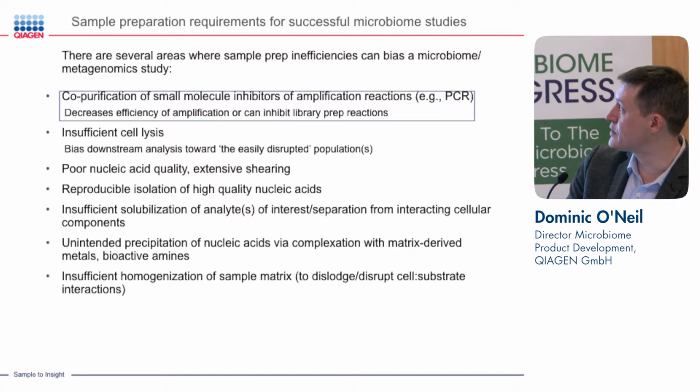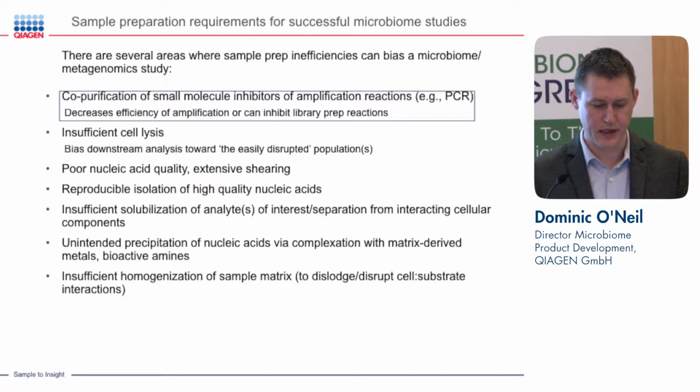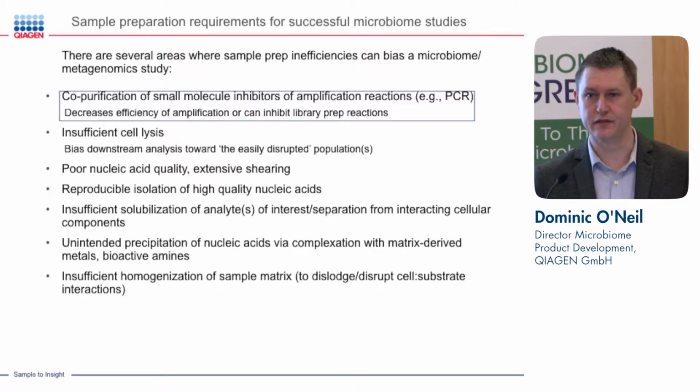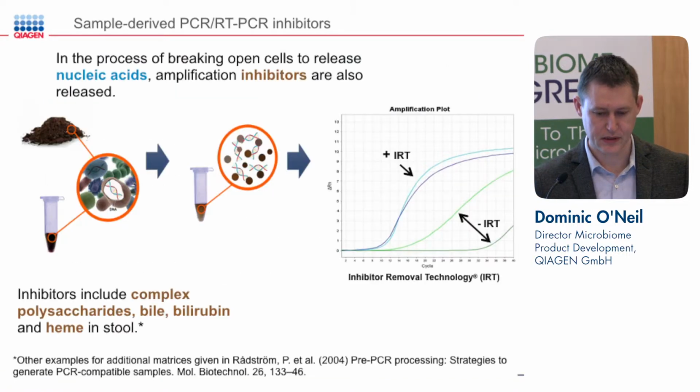The other things up here on the list, I'm not going to go through them one by one. They are issues that come up with basically any sample preparation, and they're honestly quite well solved by Qiagen's expertise in the sample prep area. So as I said, I wanted to focus a little bit more on this co-purification issue.